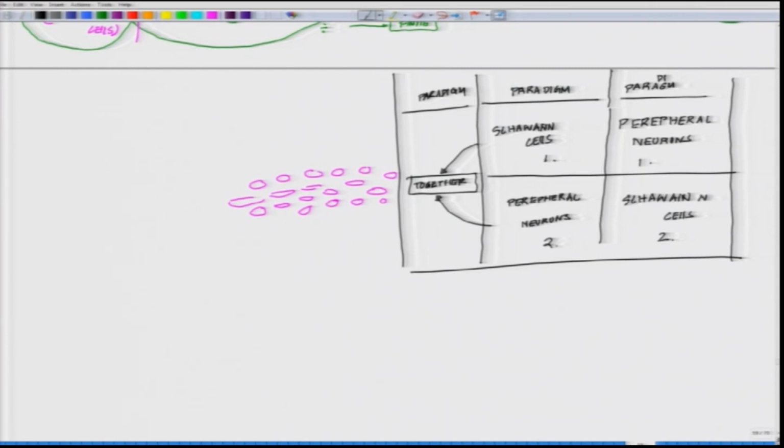The second situation is that you put the Schwann cells first out here, and on top of that you start putting the neurons, assuming that as the neuron sends out its processes, these Schwann cells will come along and form the wrapping. Or you have a third situation, which is out here, you put them together.